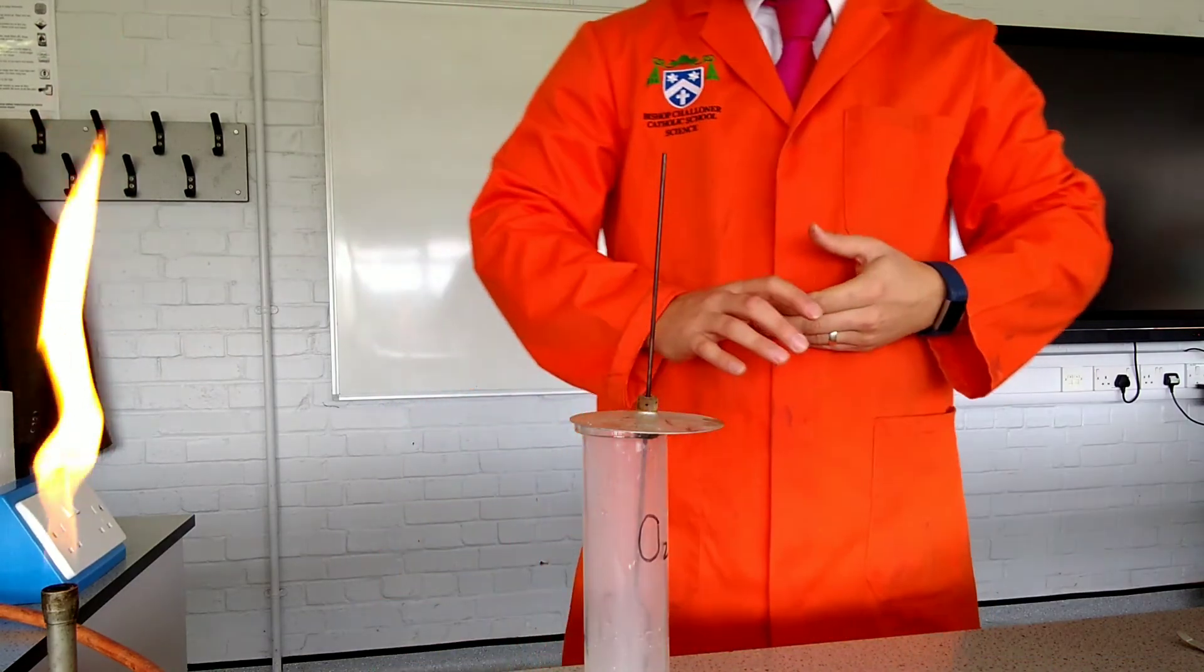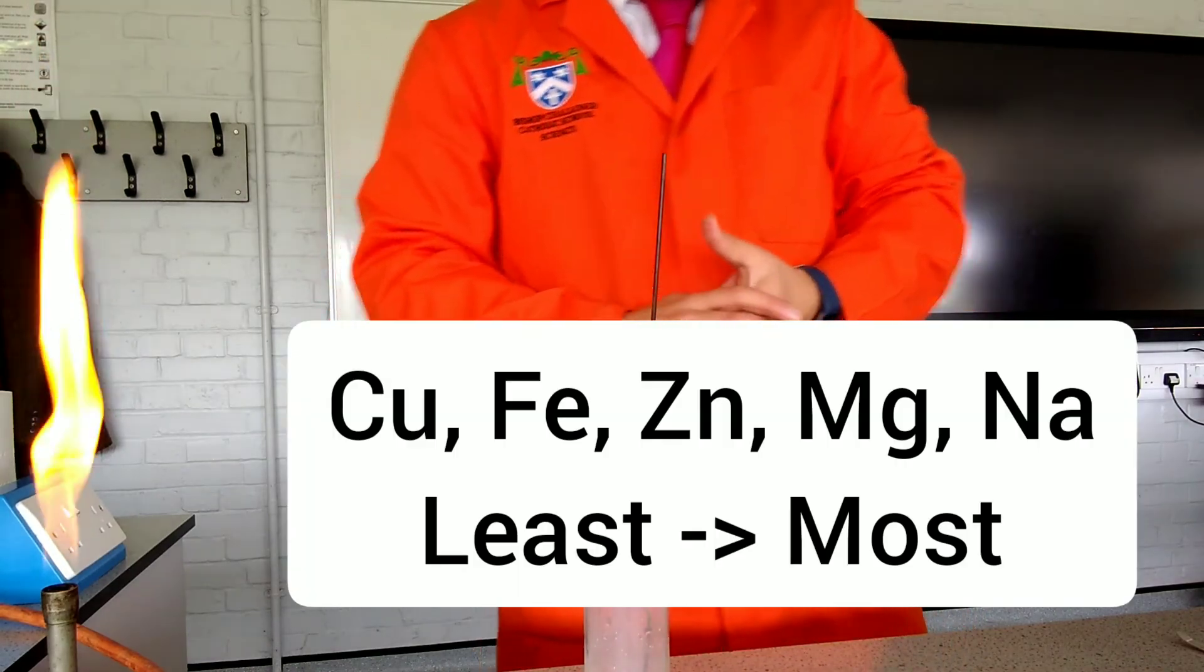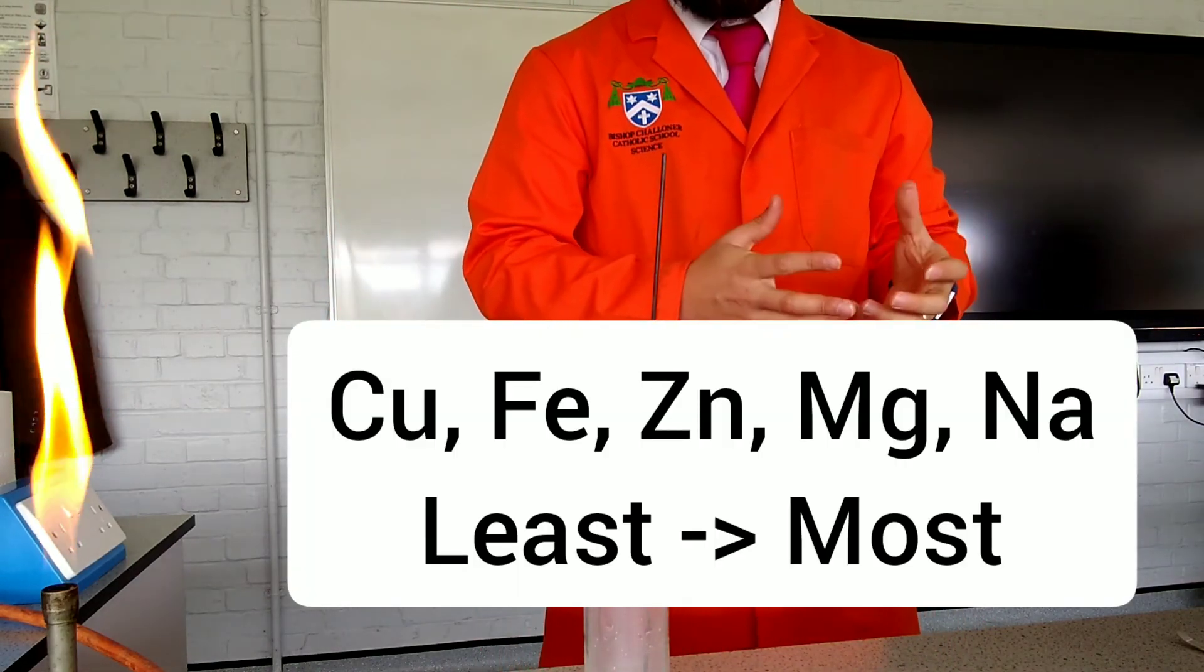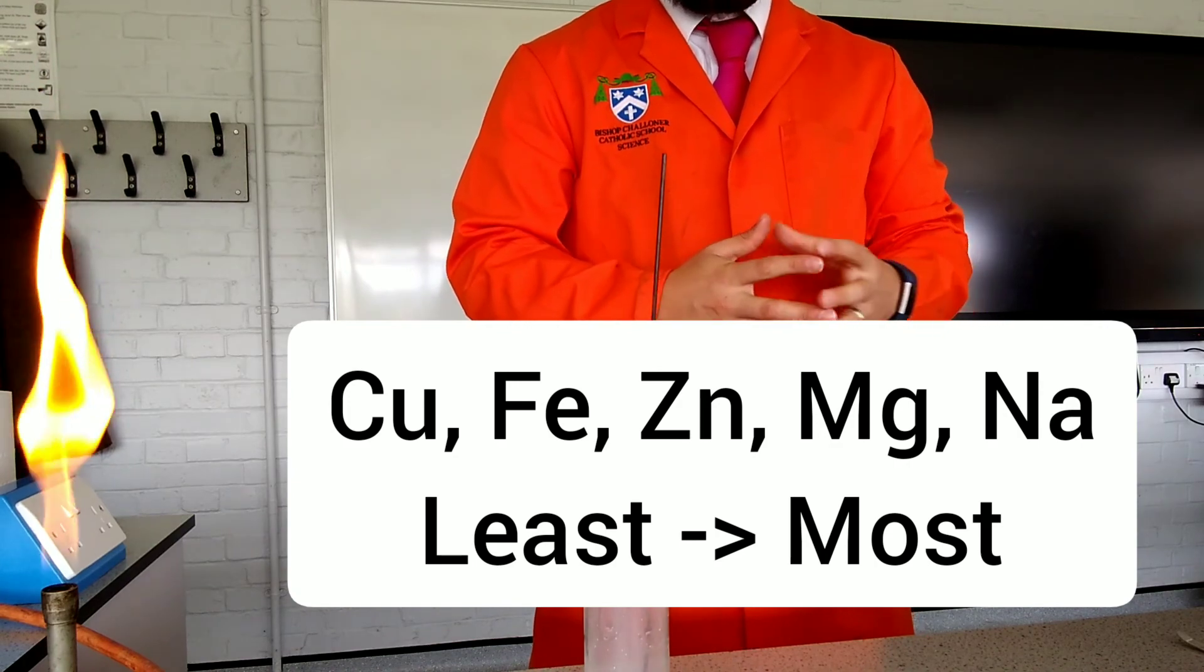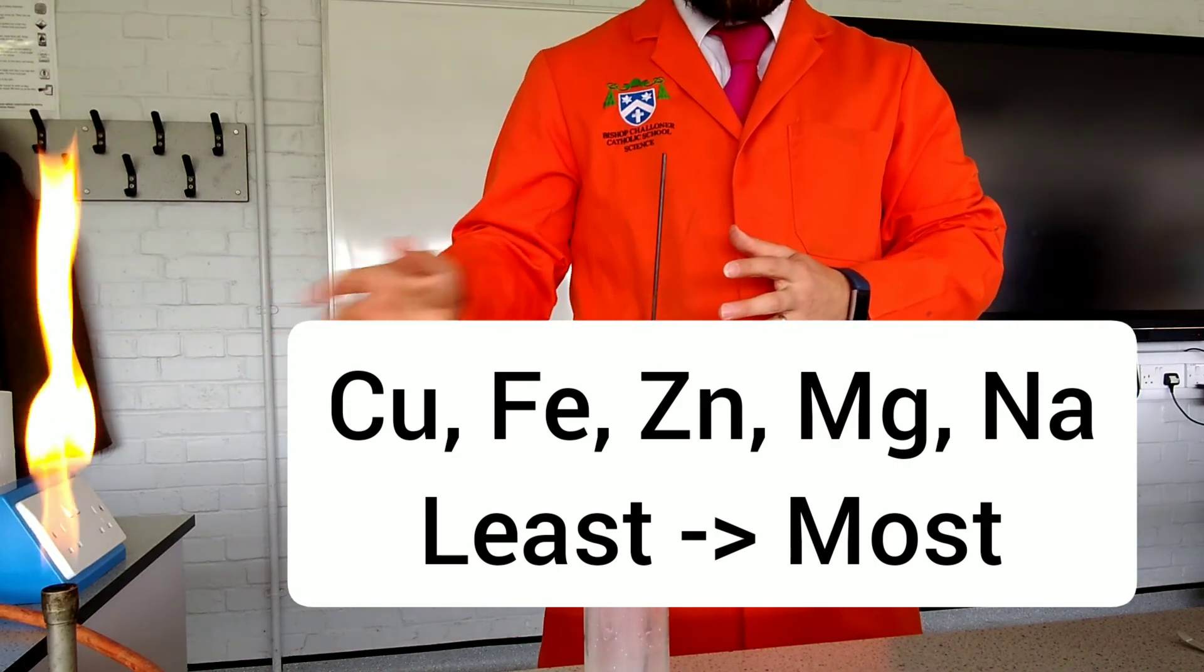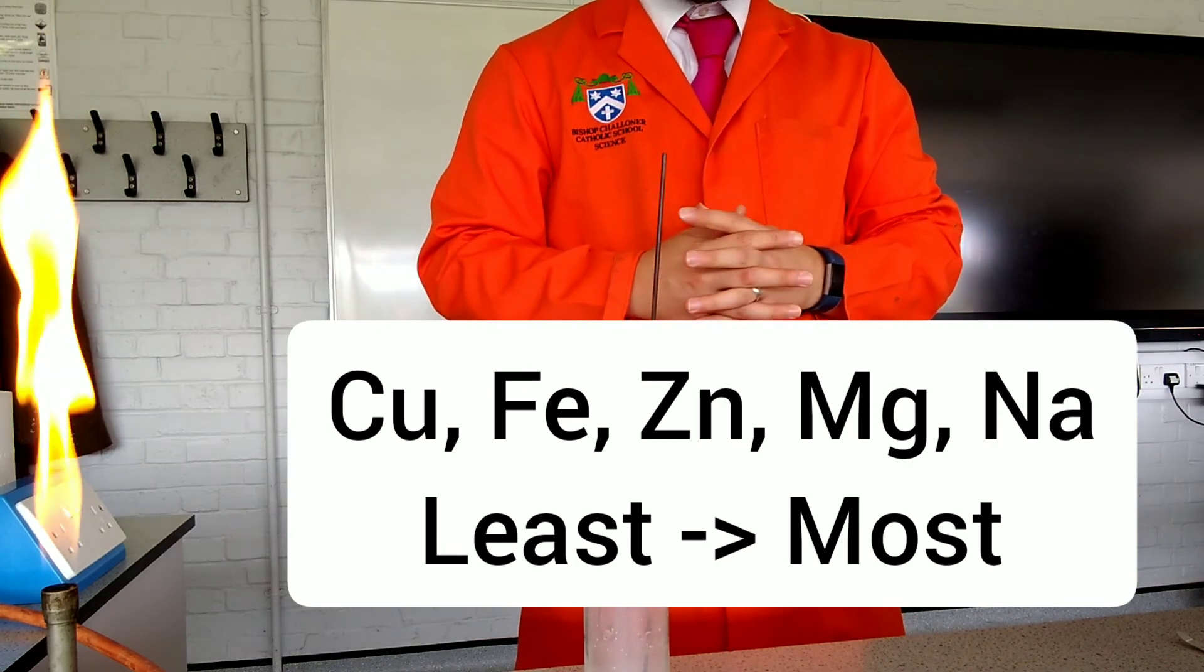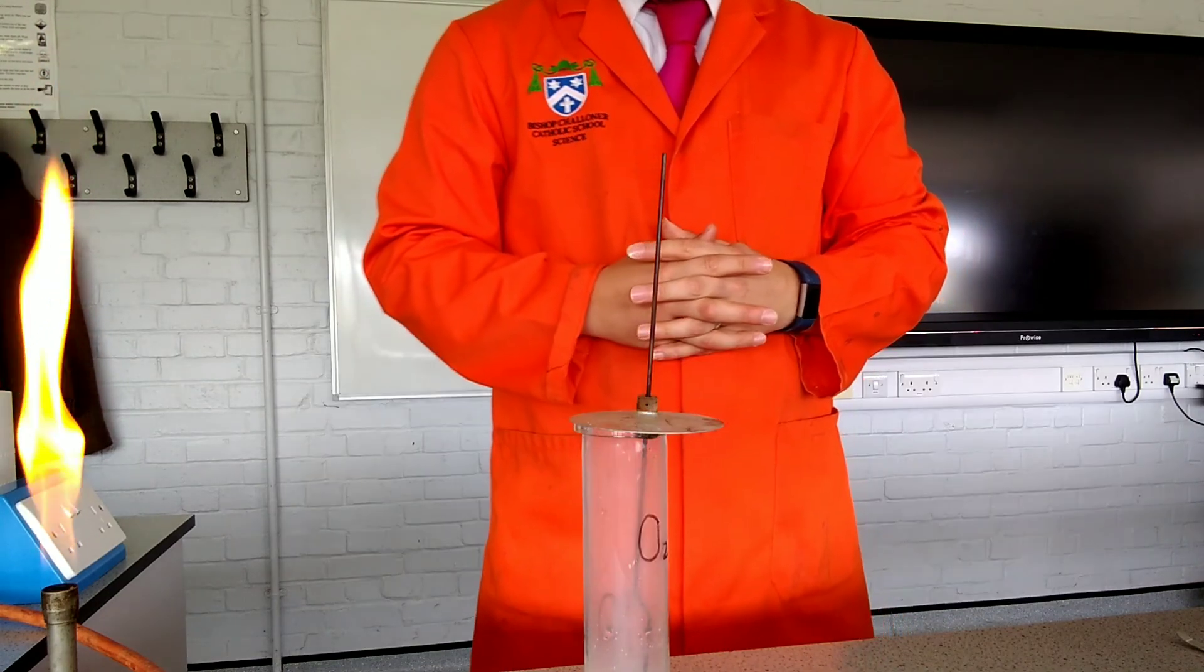So if we were to place these reactions in order, we should have copper as the least reactive, and sodium as the most reactive. Iron appeared to be more reactive than it probably was because the iron wool that we used had a really large surface area.